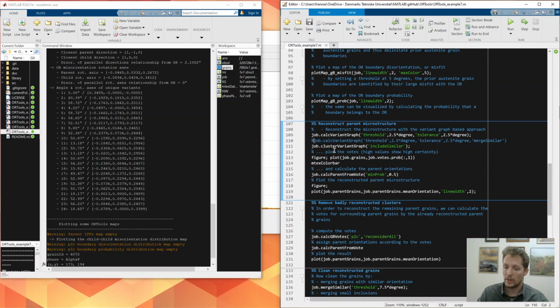There is a way of running the same command with this extra option merge similar, which is right now commented out. What this function would do is look for variants that are very close to each other: we have 24 variants, but maybe we can just merge some together in order to have fewer variants to run our analysis on. Fewer variants first sounds quite bad, right?